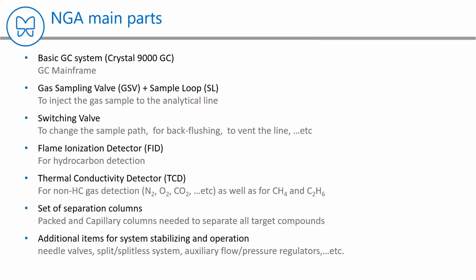I think everybody knows the principle of FID and TCD. If you need any details about FID and TCD separately, we can discuss it later. But in a few words, just to reach all participants in our webinar: FID is based on flame ionization, so it can detect all components that can be combusted, for example, hydrocarbons.